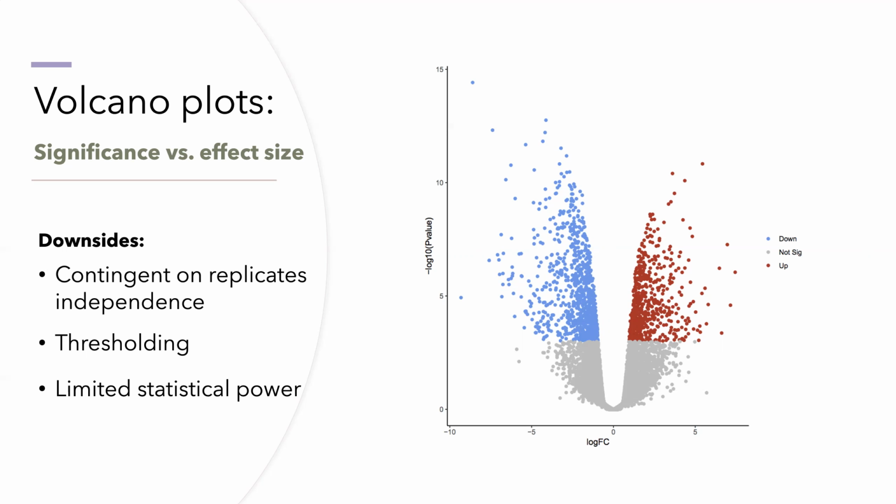It is very frequent to assume that data points obtained from replicates are independent in estimating p-values, and this assumption is going to inflate the confidence of p-values, and therefore proteins that appear significant, in fact, may not be significant. That might simply be a reflection of having assumed more independence of the data points than is warranted.